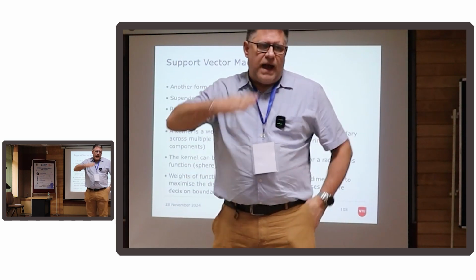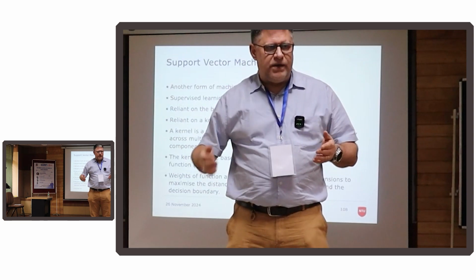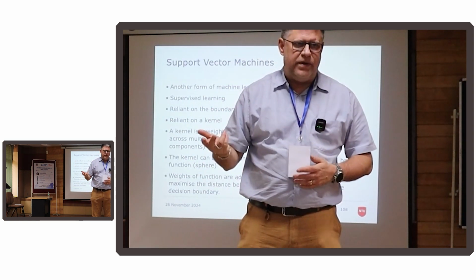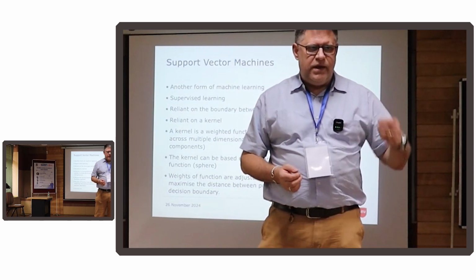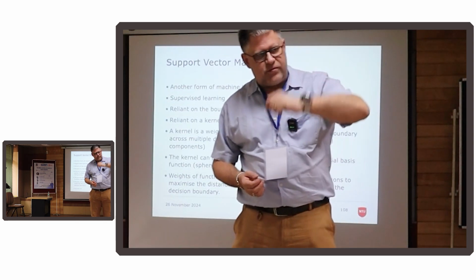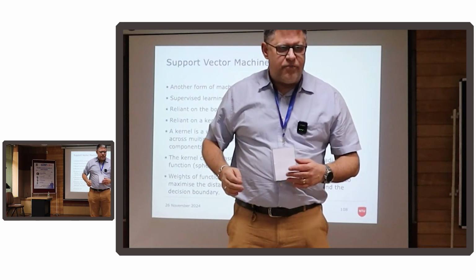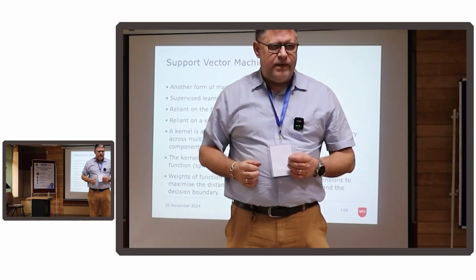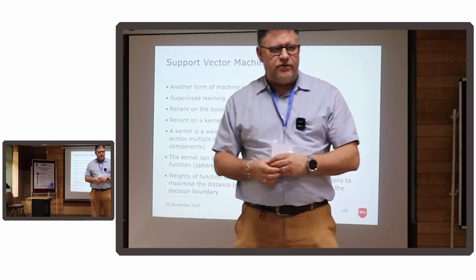So we're adding things into the model to build the model up in a stepwise fashion based upon performance. We start off with the best single one, then the best pair, the best triplet, best quadruplet, and so on, and keep growing the model until we stop getting an improvement in performance. So that's another way of building up a model from these data sets.